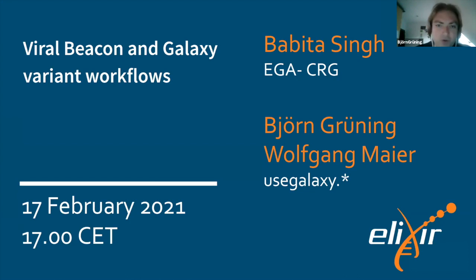With a focus on COVID currently, but they are already planning ahead and including other diseases. So that would be a nice collaboration, I think, to extend Beacon for other diseases like swine flu and so on. I think there are a lot of opportunities here to make data more accessible with Beacon.